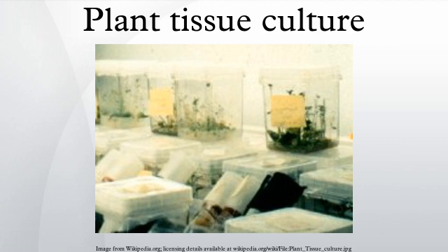An alternative for obtaining uncontaminated explants is to take explants from seedlings which are aseptically grown from surface sterilized seeds. The hard surface of the seed is less permeable to penetration of harsh surface sterilizing agents, such as hypochlorite, so the acceptable conditions of sterilization used for seeds can be much more stringent than for vegetative tissues.